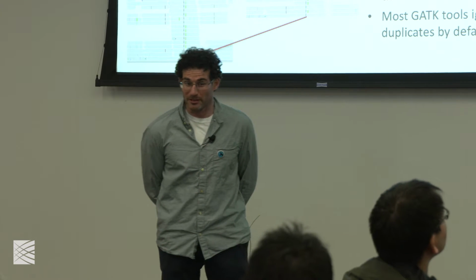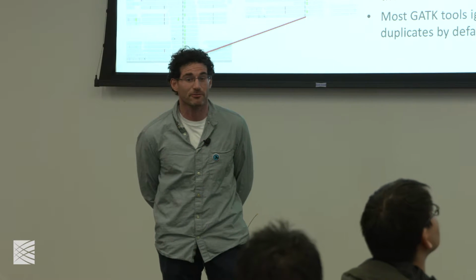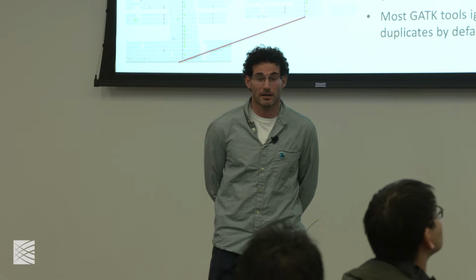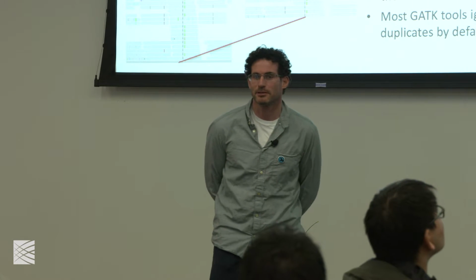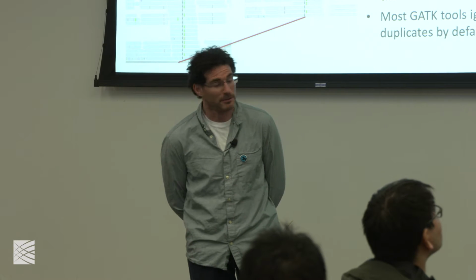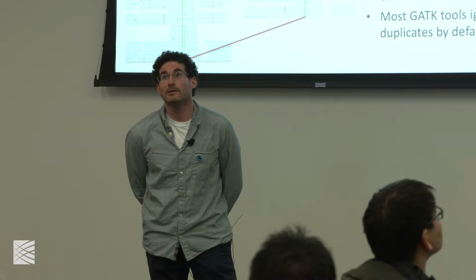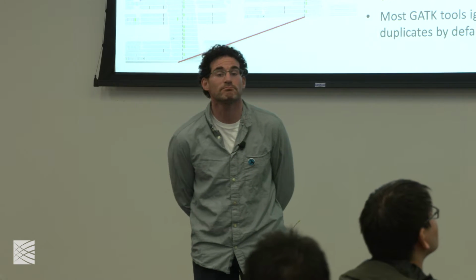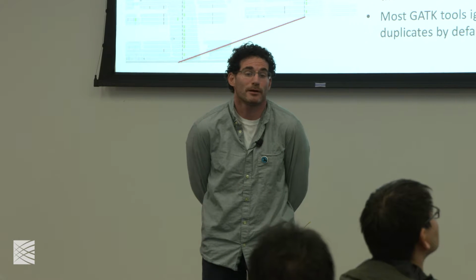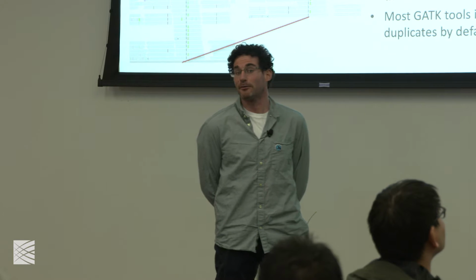I am also familiar with these pipelines. It usually has to do with very short and poor quality reads. For example, the ancient genomes pipelines do this. I'm not familiar with any other pipeline that's not part of the ancient genomes pipelines that does this, but I'm not familiar with all the pipelines. I question the importance of doing that, but I don't know enough detail, so I can't really comment. None of our pipelines do this.